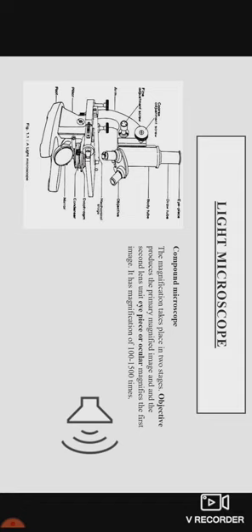To magnify the object, power of objective. Objective has 3 magnification powers. One is of 10 times magnification, second is 40 times of magnification, and third one is 100 times of magnification, and all are attached to a nose piece that is movable.